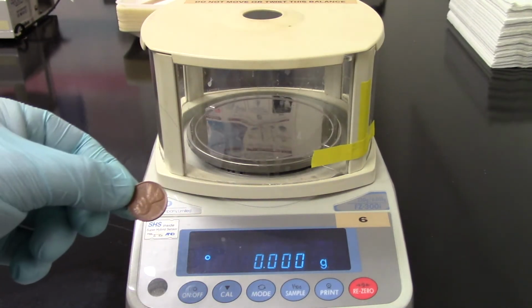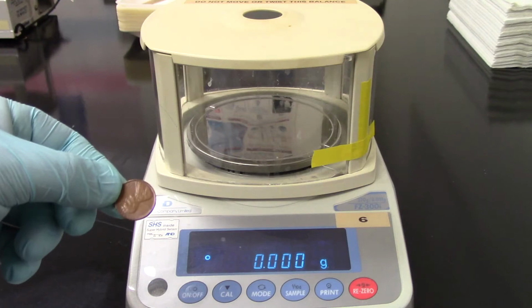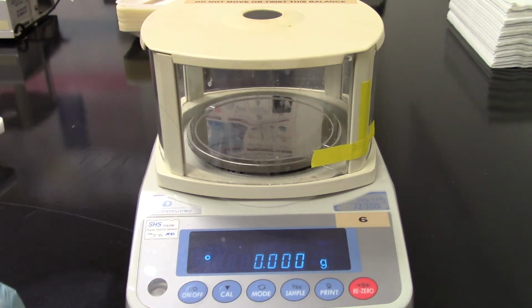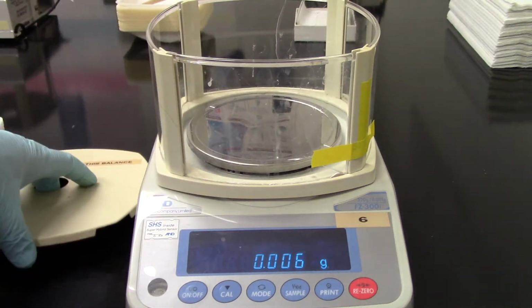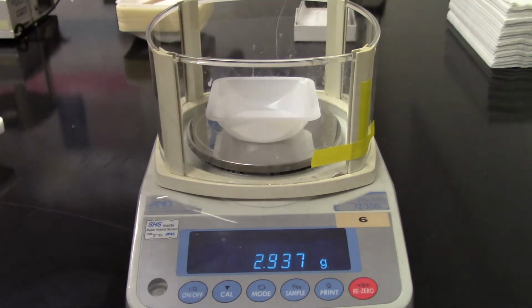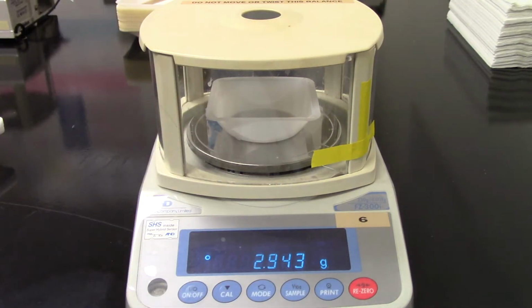What I care about, however, is the mass of these pennies. That's what I care about. So I'm going to put the pennies in the tray on top of the scale. It's just to help protect the scale from any kind of harm that might come to it. The scale is very expensive, so we always try to protect it. So here I go, putting the weighing boat on the scale, putting the cover back on the scale, and just going to hit re-zero. So now the scale will just ignore the fact that there's something on top of it already.